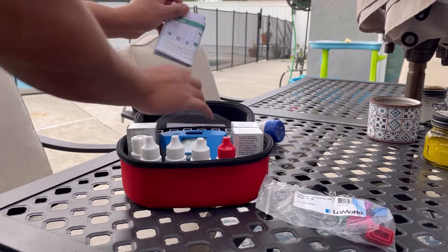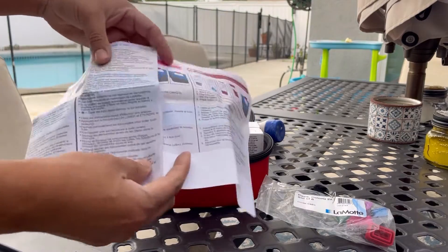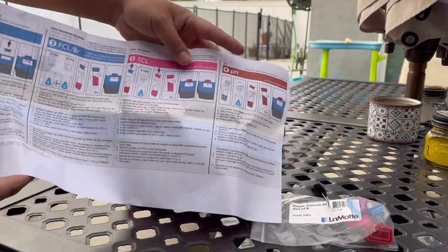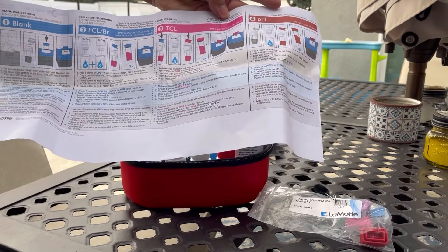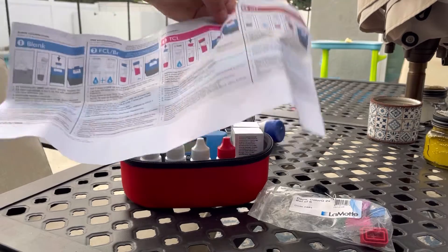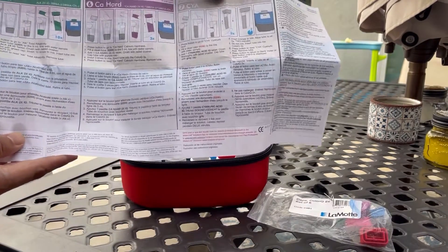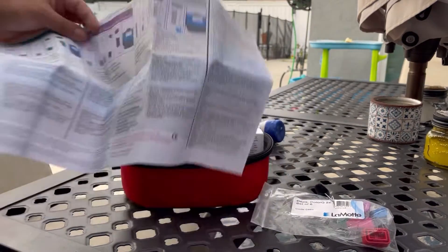It also comes with some information to teach you how to perform each test. It's very detailed on how to test for chlorine, total chlorine, and pH. The back includes alkalinity, calcium hardness, and CYA levels. So let's go ahead and get our sample water and get to testing.